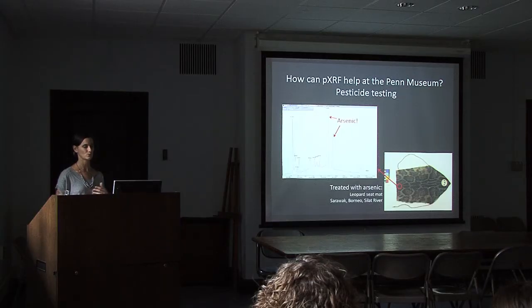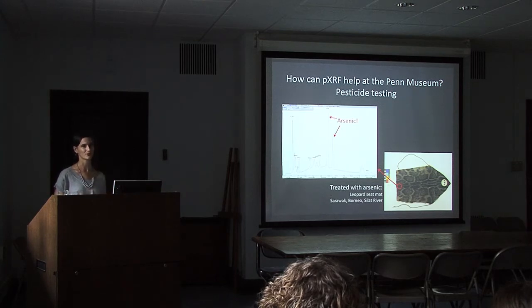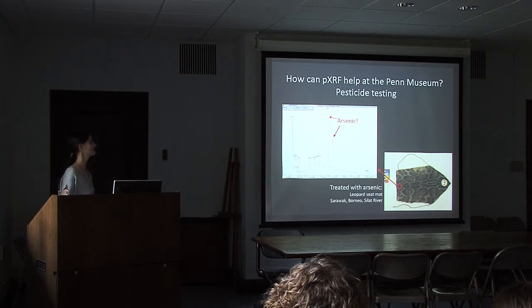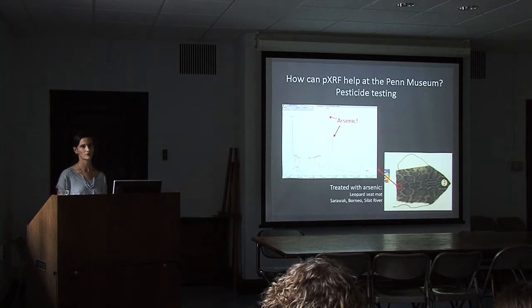Now that we know that it's been treated with arsenic, we can take measures to protect ourselves. One, in addition to all the other wonderful benefits of bagging artifacts, bagging gives us a physical barrier between us and the toxin. It also prevents the spread of arsenic and transfer by physical contact onto other objects. We've now labeled the object, we've documented that it's been treated with arsenic, so we can inform anybody who's handling or working with the collections to wear gloves and to not touch their face while they're working with it. So it's really useful for us for our own health and safety.